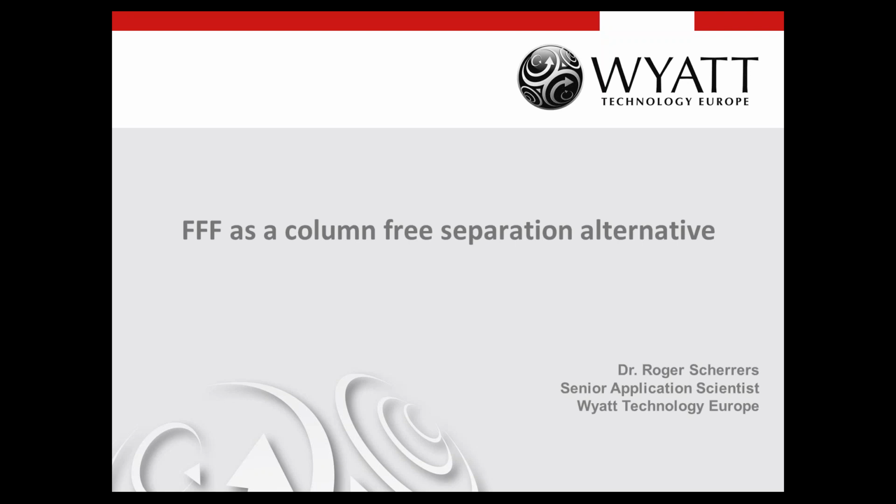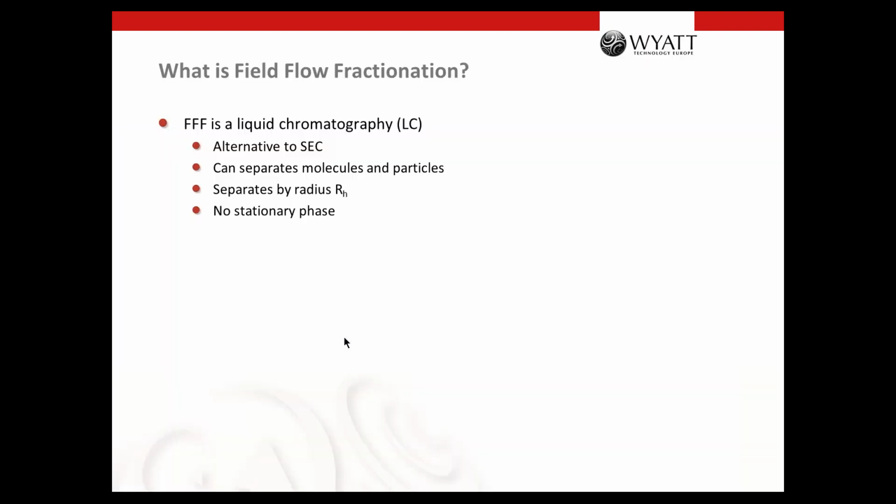Yeah, thank you, Melanie, for the kind introduction. So I will try to explain to you today how FFF is working and how it can help you to overcome problems with other separation methods, or to give a method which allows you to separate your samples like particles and very huge polymers which normally do not run over a normal SEC column.